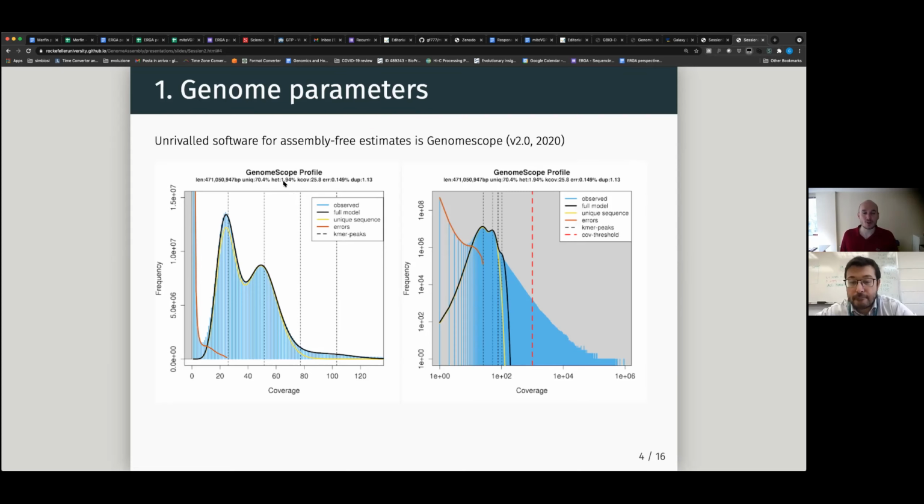So you also get this other estimate, and this is an important estimate in the genome assembly world, because depending on how heterozygous an individual is, you may want to use different tools to assemble its genome. Because essentially the tool can work better if there is very low heterozygosity. That has been the case for a very long time.